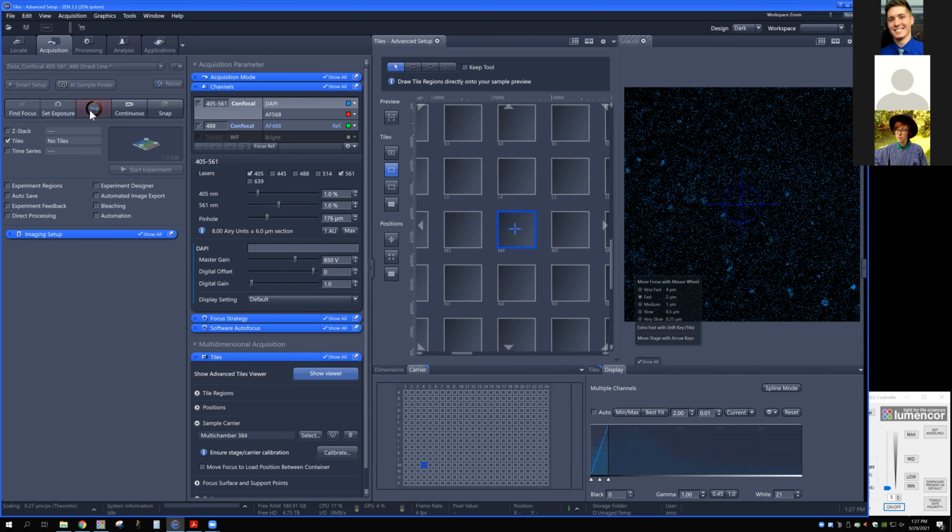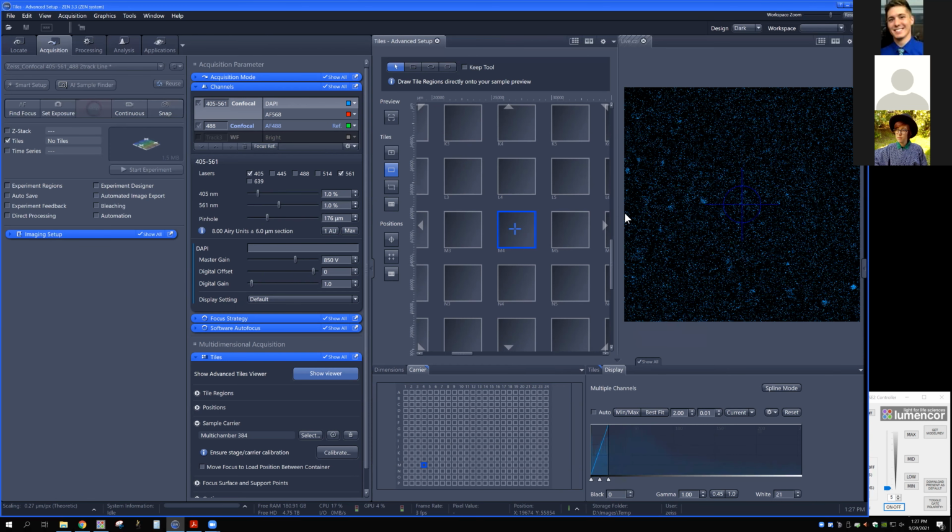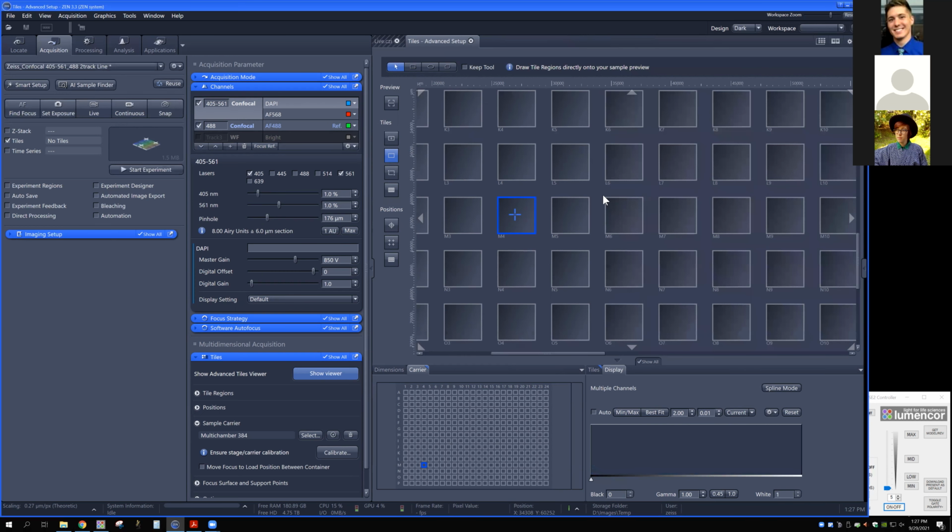All right. Okay. Well, we're going to continue to optimize, I think, as we get set up later on. But just to quickly run through how you work with the tiles tool for this. Yes, great question, Brandon.